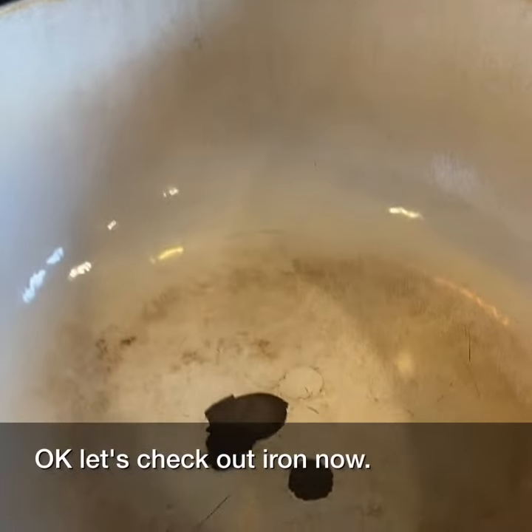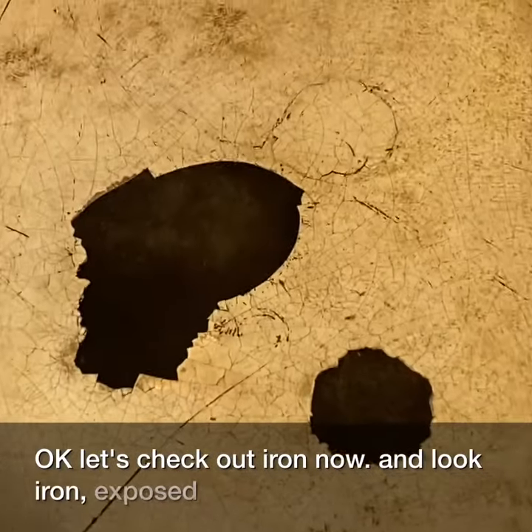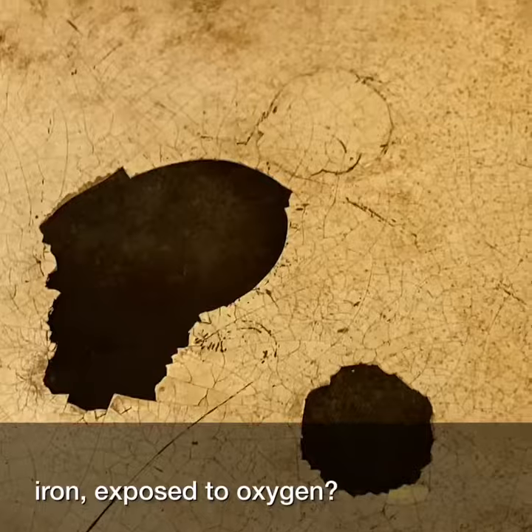Let's check out iron now. And look — iron exposed to oxygen. No fire.